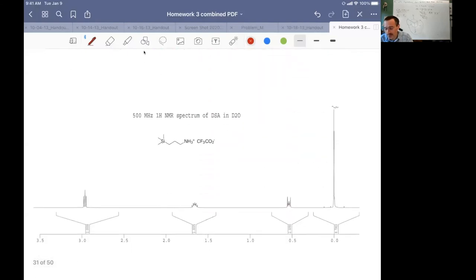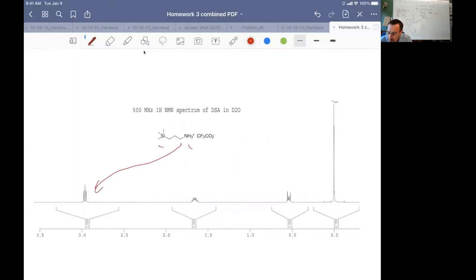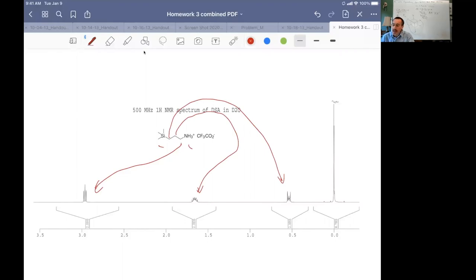Here's another example: a bulky TMS group on one end, a not-so-bulky ammonium group on the other end. The CH₂ next to the ammonium group looks pretty much like a triplet, but the CH₂ next to the bulky silicon has the same goalpost pattern, and the CH₂ in the middle is not a simple quintet — it's a very different pattern. Again, we have a non-first-order spin system.